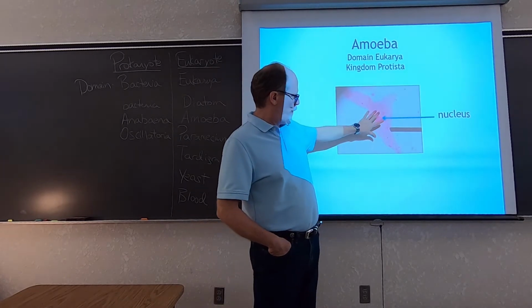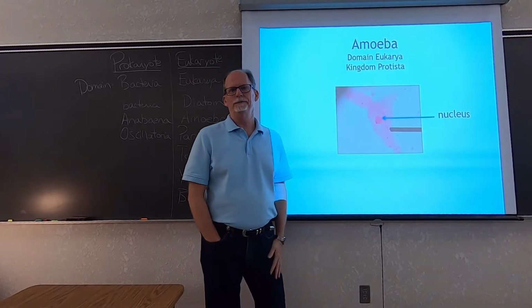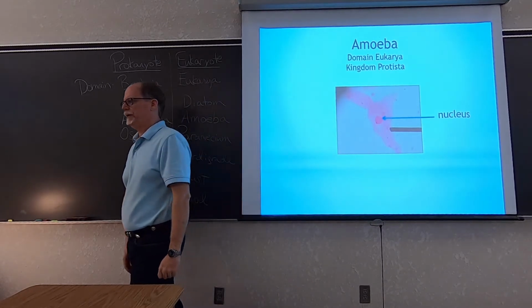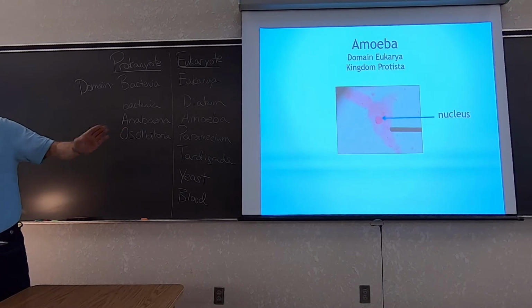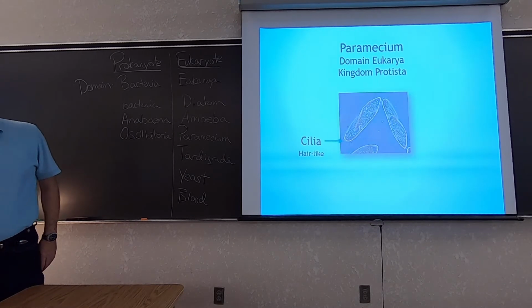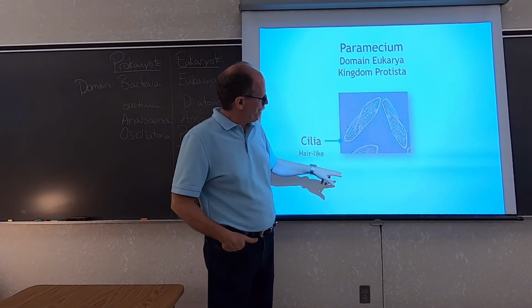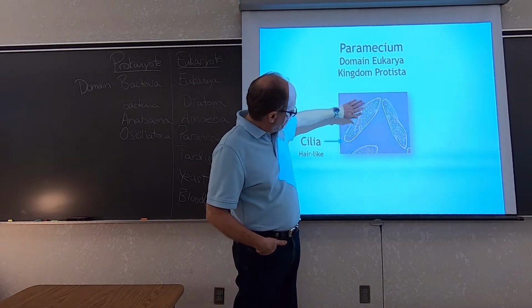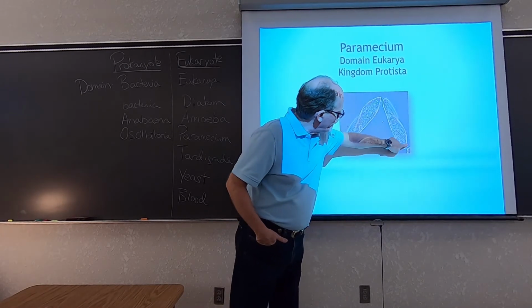When you take this for the practical, I'll tell you to recognize this type of organism by the color. So sometimes the colors can help. And that's just the color that they turn that organism into. When they put them on the slide, they give them a color. Like this one really doesn't have a color per se. It's not been stained. Right? This would be the water that it's in. This is an organism. This is another one.